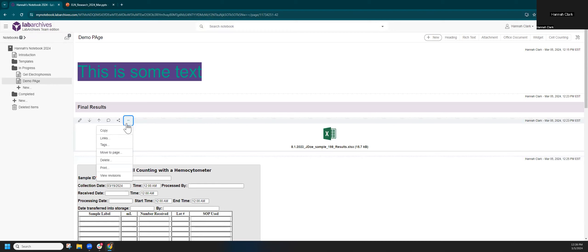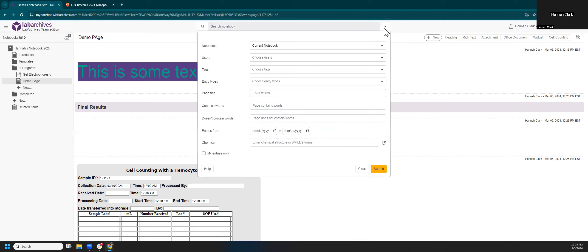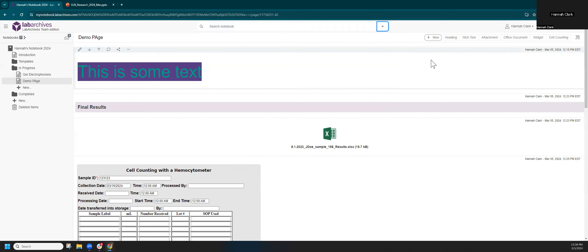Some features to explore later include links and tags. Links are helpful for referencing data stored externally — a website, a procedure, or an SOP within your notebook. Tags are a great way to improve search within your notebook by adding labels and terms. Advanced search tools at the top allow simple searches or complex search logic with tag filters, date filters, and more. We also provide tools for page signing and page witnessing for FDA-compliant groups or those applying for funding requiring that workflow, including support for FDA 21 CFR Part 11.